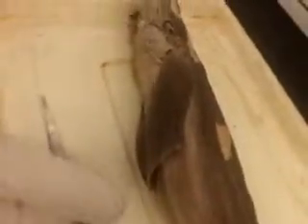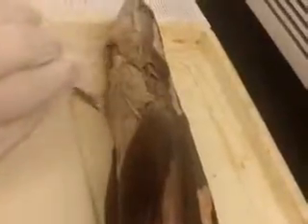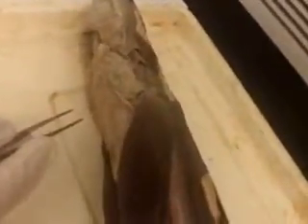And next we have the pectoral adductor or flexor. Now that is on the other side of the fin. You can kind of, not really, see it, but it's at the coracoid bar. It originates at the coracoid bar of the pectoral girdle, is inserted in the pterygophores, and it is homologous to four muscles of the necturus, which are the pectoralis, coracobrachialis, humeroantebrachialis, and the forearm flexors.